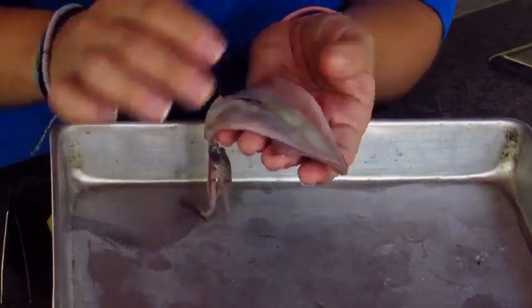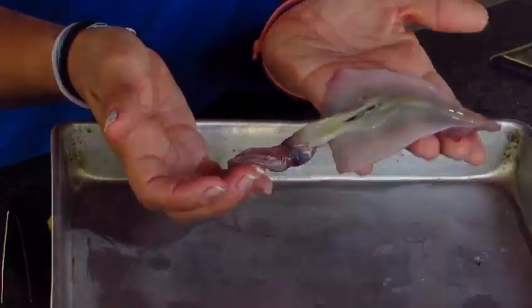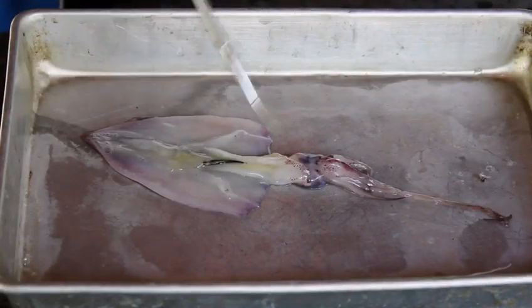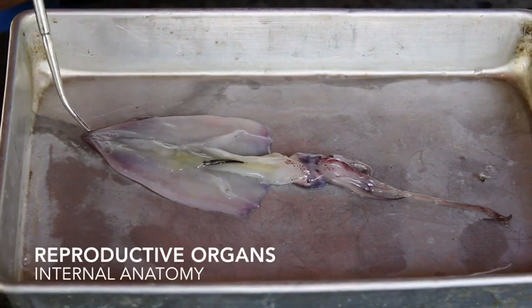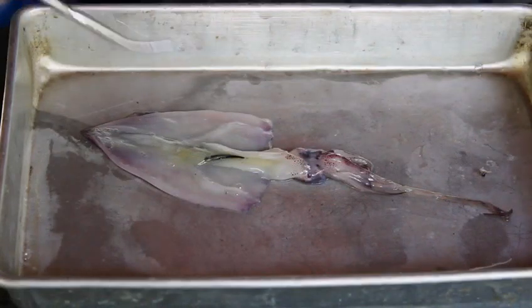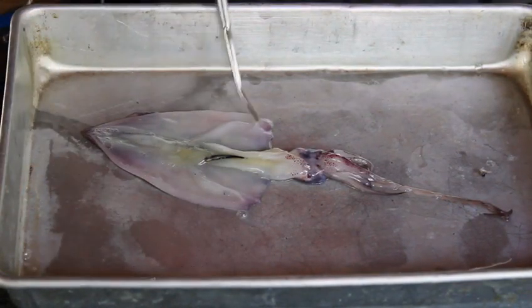Once you cut that open, you just fold this back like a flap, and there you can see your internal organs. This is the internal anatomy of our squid. Up here we have our reproductive organs. Here we can see that we have a female. These are the gills. They still breathe oxygen like you and I, but they filter it out of the water.